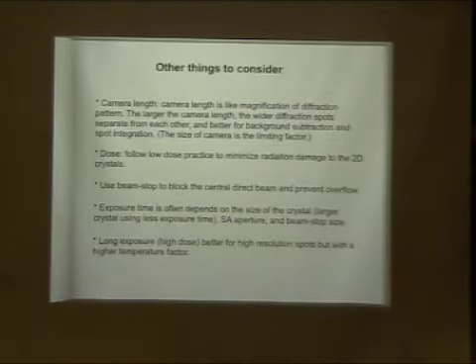If you have a large crystal, you can use a large beam stop, and then you can still use the same long exposure time to really get a high resolution diffraction. But if you have a small crystal, use a small beam stop. I also thought of having two beam stops of different sizes you can choose, right? But it was never actually done this way.